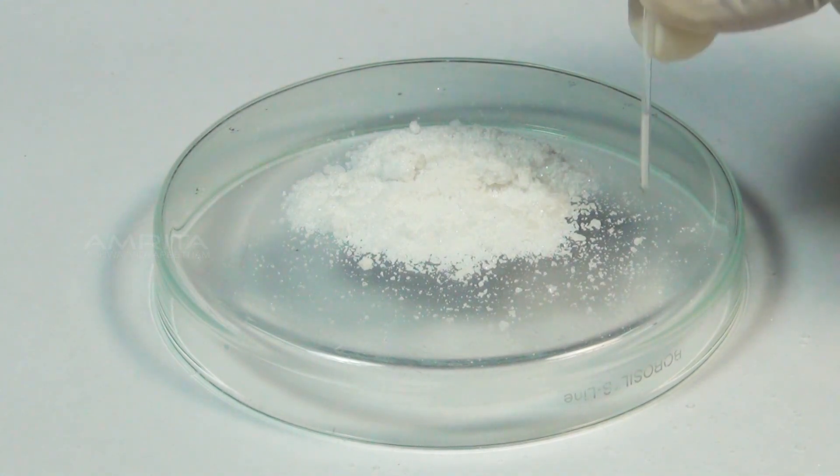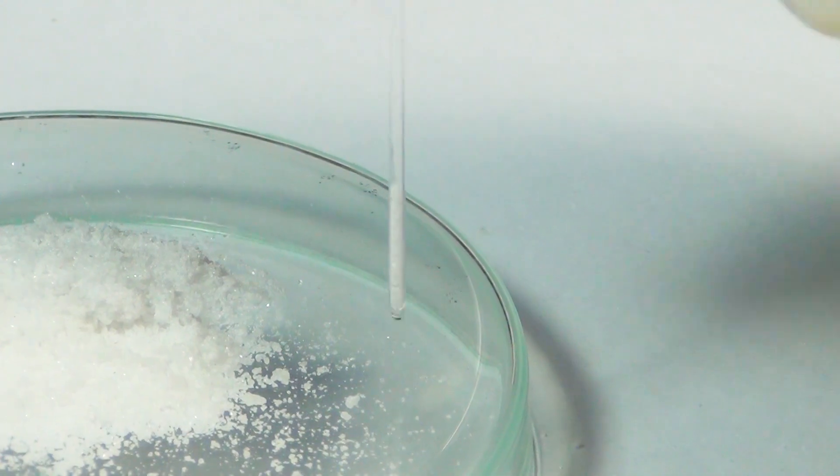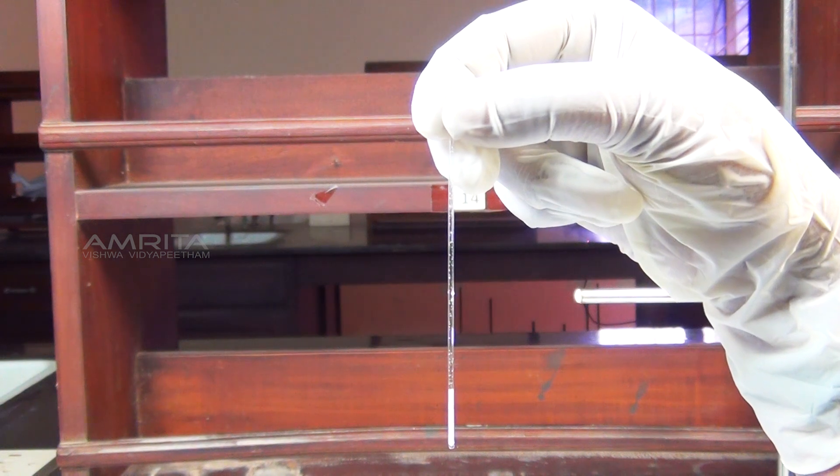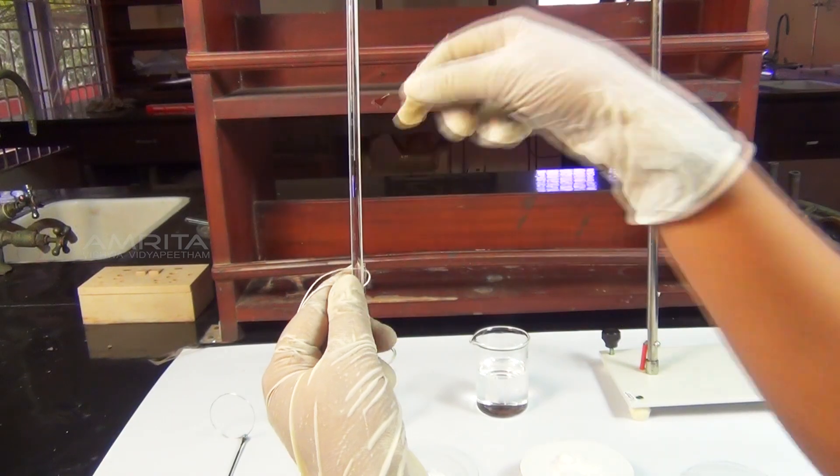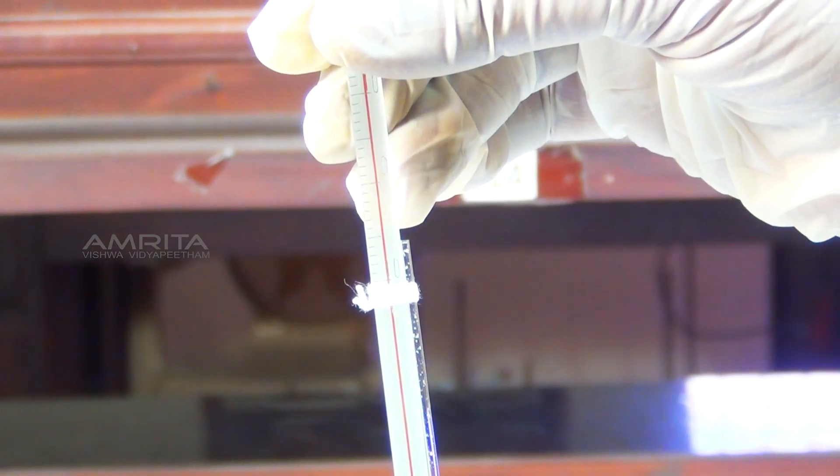Now, tap the sealed end of the capillary tube on the glass plate gently and fill the capillary tube up to 2-3mm. Attach the capillary tube to the thermometer using the thread.